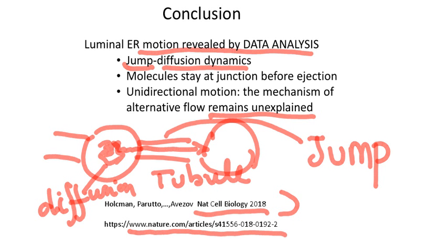So I'll stop here, and we will finish with a third part where we will explain how from this single particle trajectory we can generate a graph in the sense of graph theory that can be used to extract more of the statistical properties of the ER. Thanks.